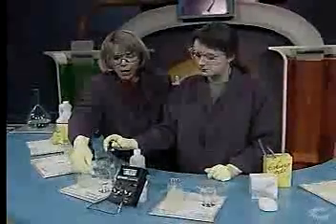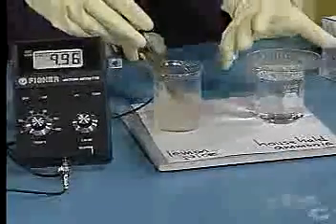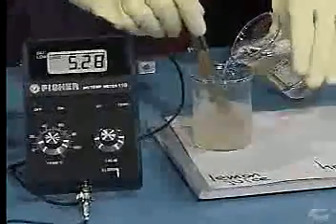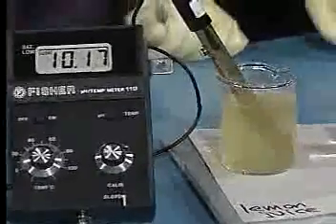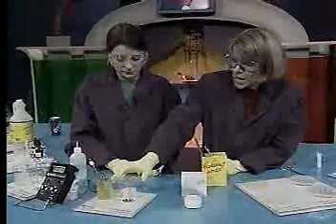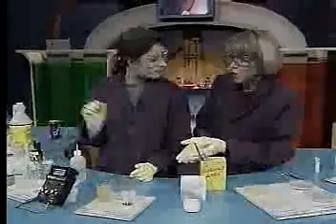All right. Now, next diagnostic test is taking a look at neutralization. Acid and base solutions neutralize each other. So, let's put the probe into the lemon juice, and you can pour some household ammonia into the lemon juice. It's reading now in the acid range. If we add the household ammonia, you can see that we've neutralized the solution, and now I've even gone further and changed it to the basic range. So we've neutralized the solution first. Good.